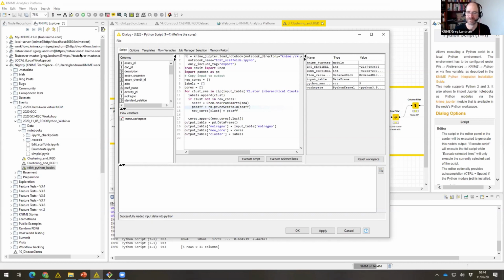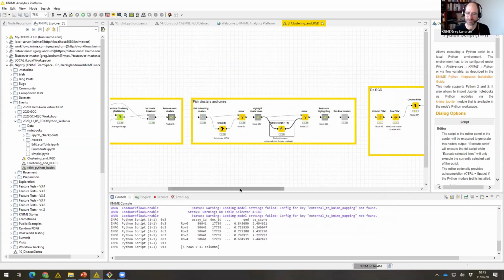Okay, there are a number of more questions coming up. Maybe this one is fitting at this point. Is there any way to draw molecules of which the MCS is depicted in the same orientation? Yep, let's do that because this workflow does that.